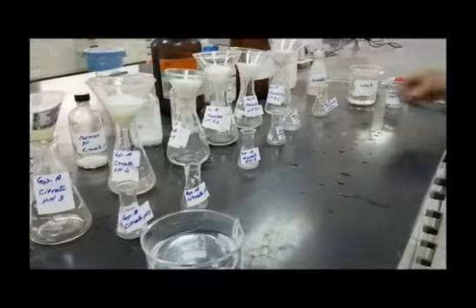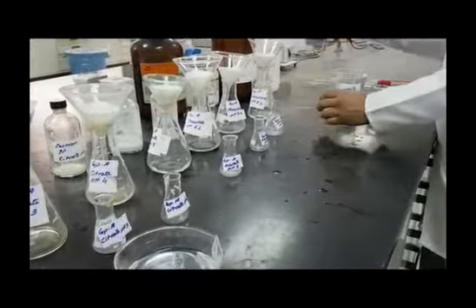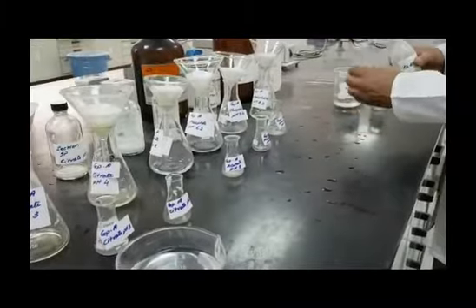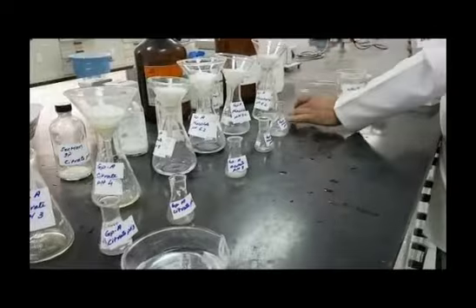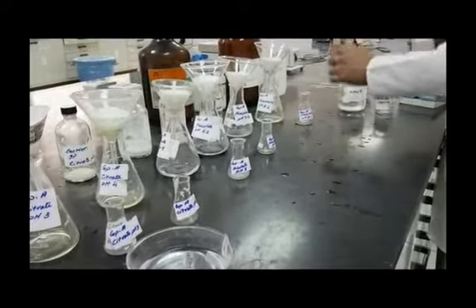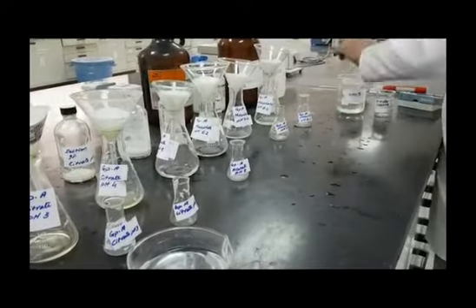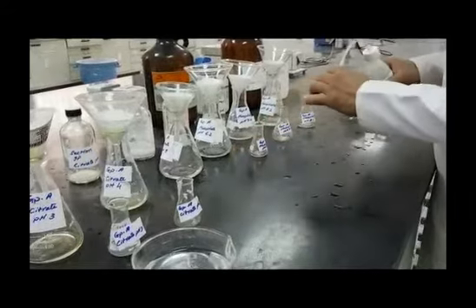Meanwhile, waiting for the filtration to complete, prepare the small Erlenmeyer flasks that will be used for dilutions. Remember that we will make a 1:1 dilution with 0.1 or 0.2 molar NaOH.